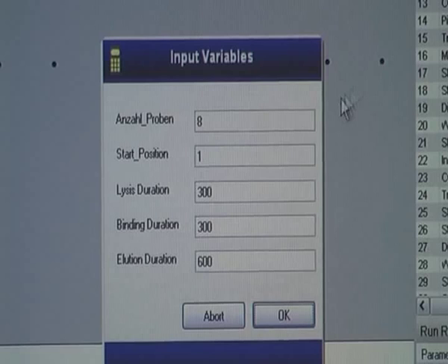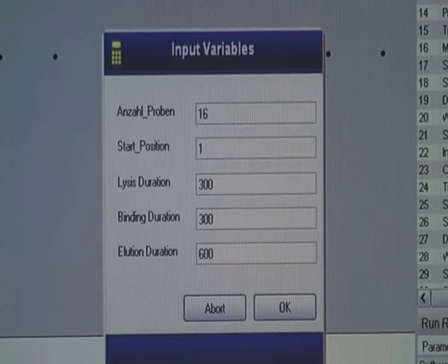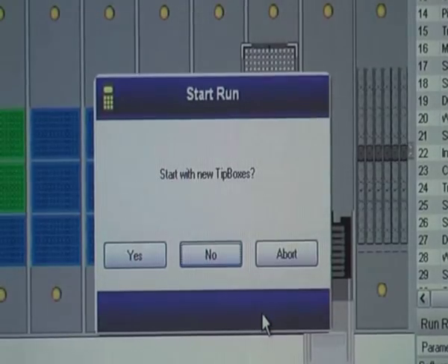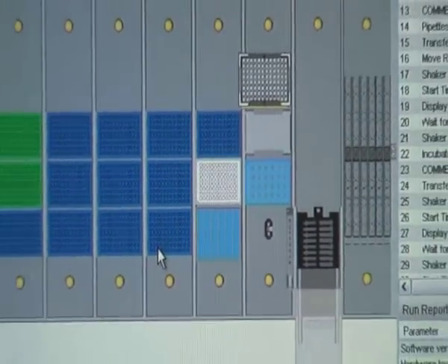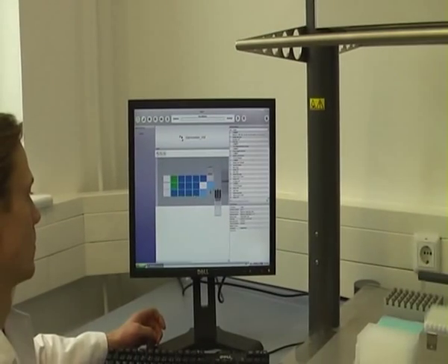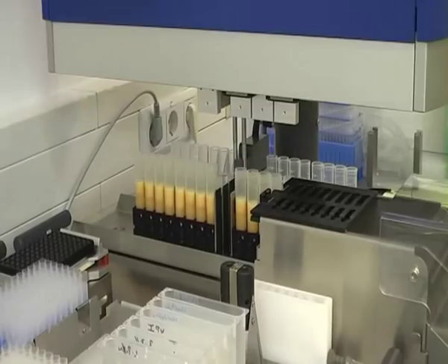After pressing the play button, a series of questions appear. Here, you can enter the number of samples, 16 in this case, and decide whether you would like to start the run using new tip boxes. After initializing the instrument, the automation steps can begin.